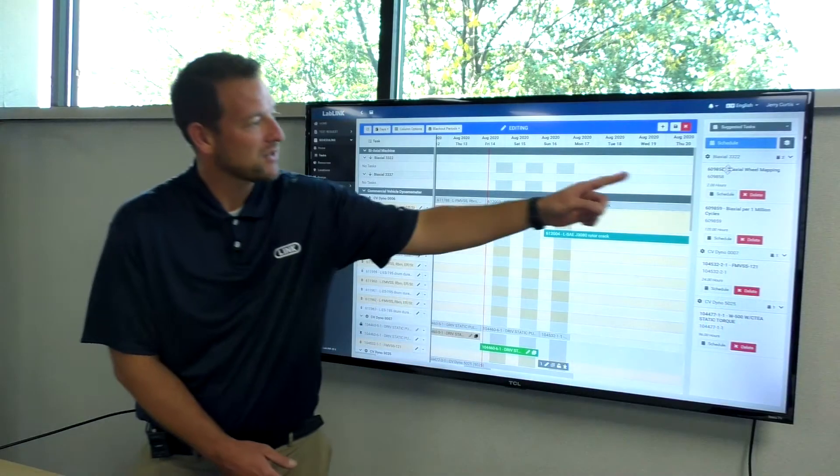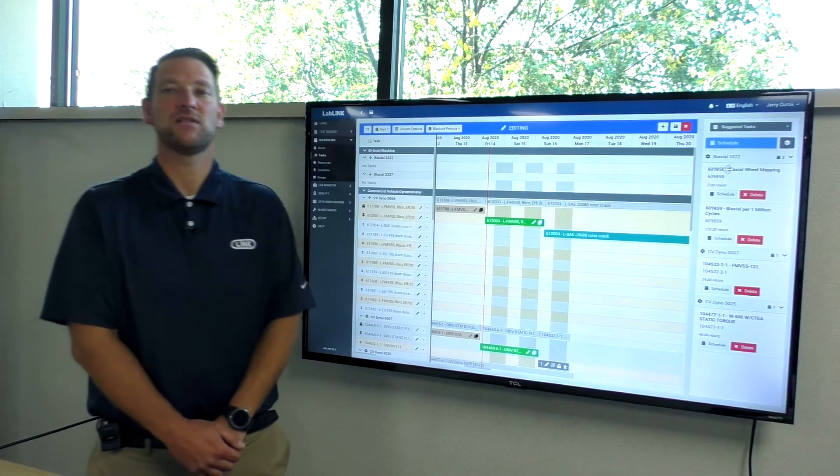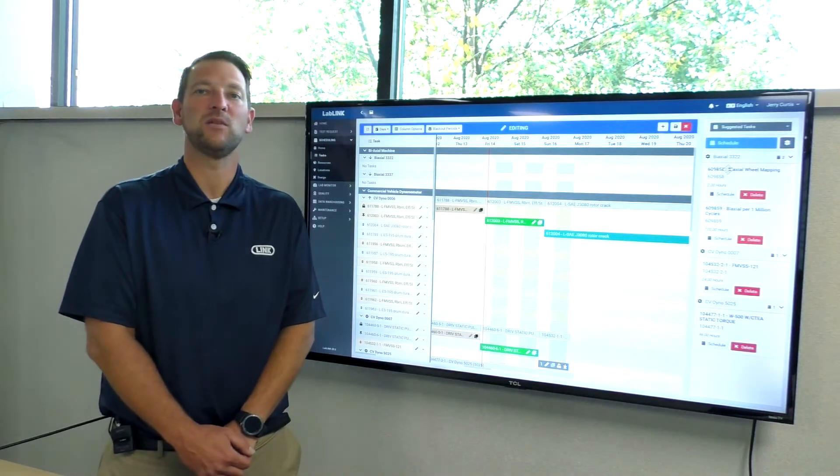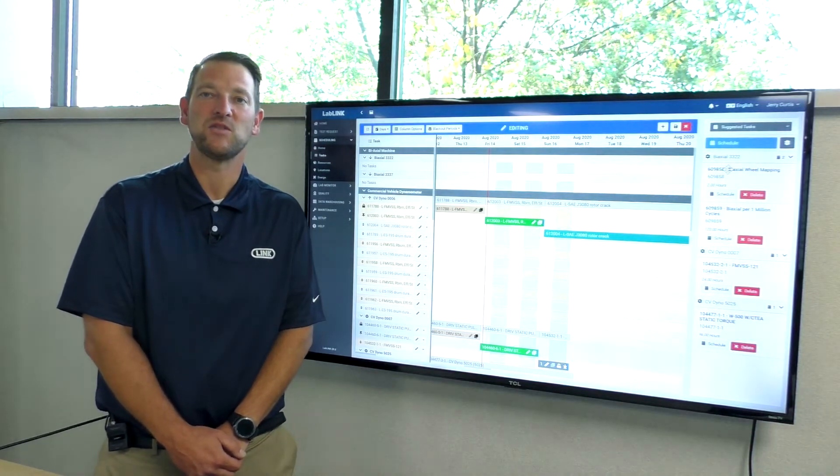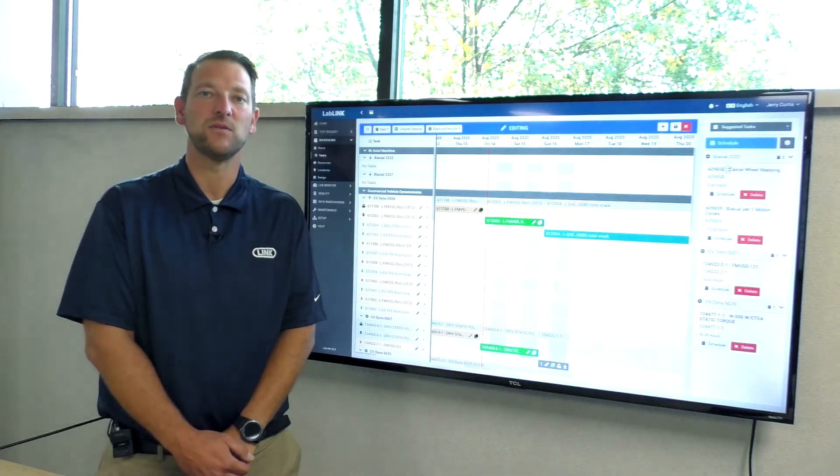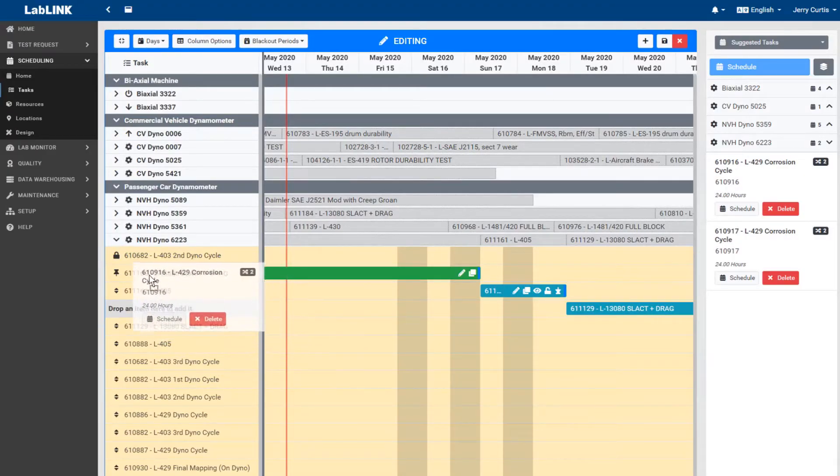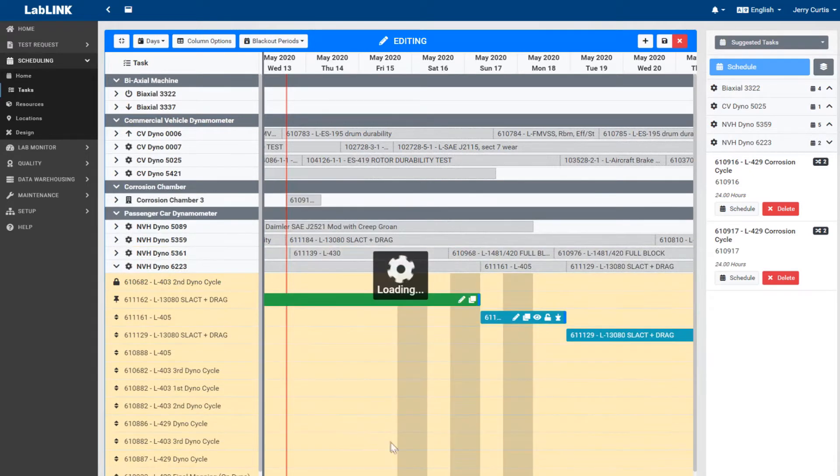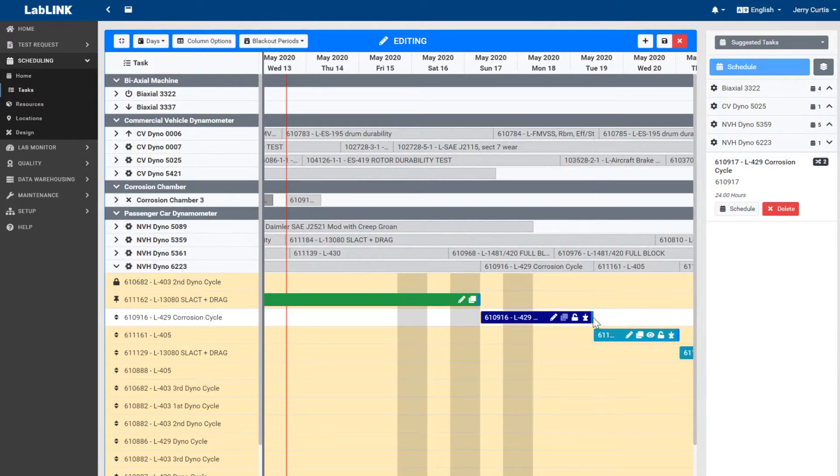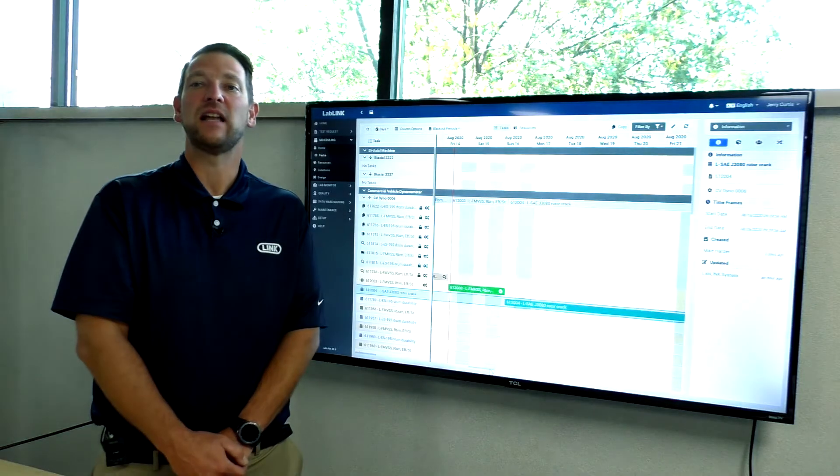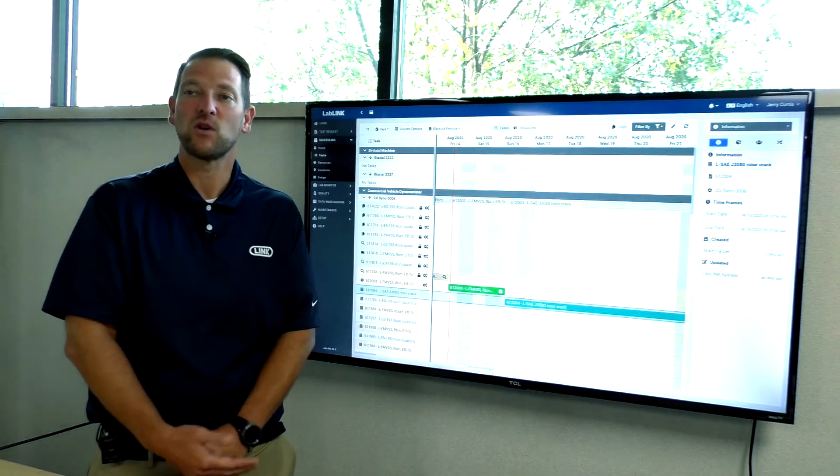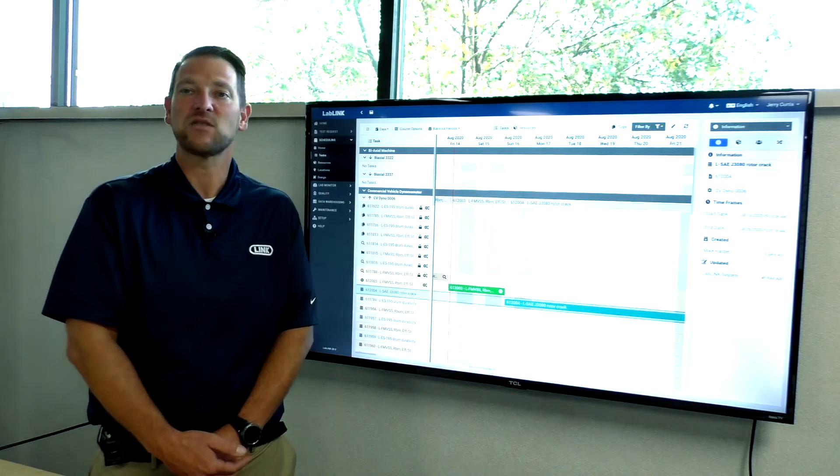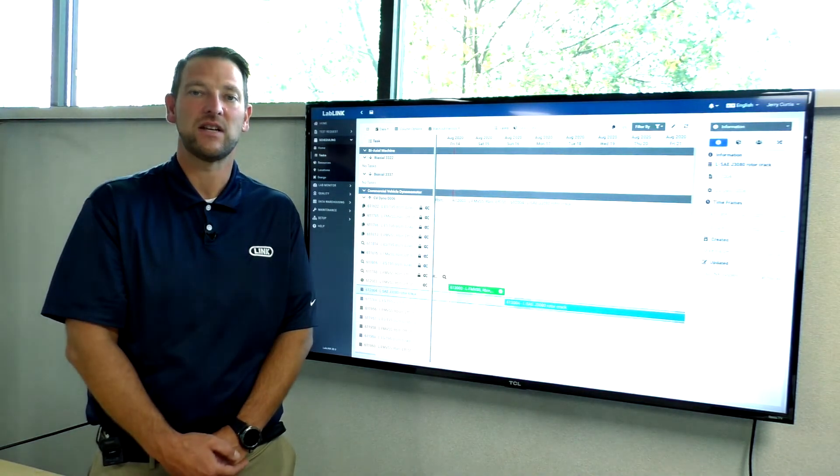All tasks created under a test request are reviewed and approved before they are available for assignment to specific laboratory equipment in the scheduling module. Through a Gantt style view, users drag and drop tasks on the desired equipment and time slot. LabLink can even automatically adjust an asset schedule based on the actual test duration or selections made at the machine. The scheduling module intuitively aligns test request requirements to machine capabilities and tasks with dependencies are scheduled against test requests.